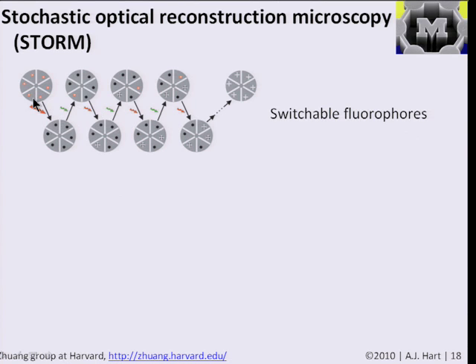They designed a fluorescent molecule that is photo-switchable. And what this means is, you take a sample. So say you have a piece of brain tissue that has this complex network of neurons and axons and dendrites where the feature sizes are smaller than the wavelength of light.